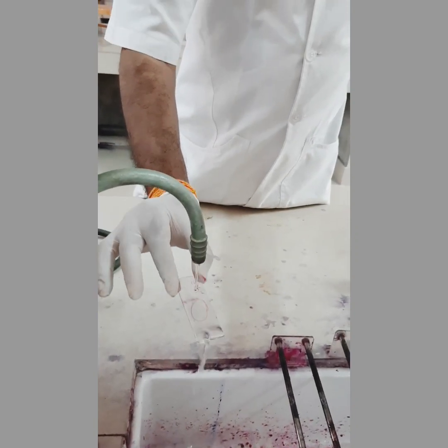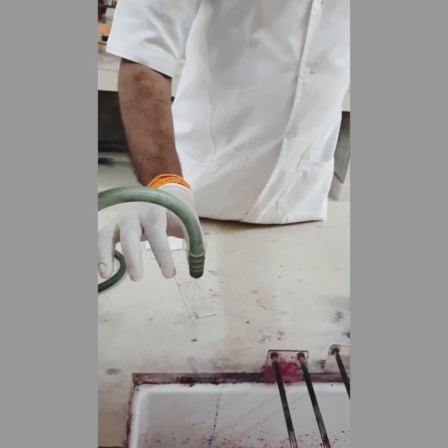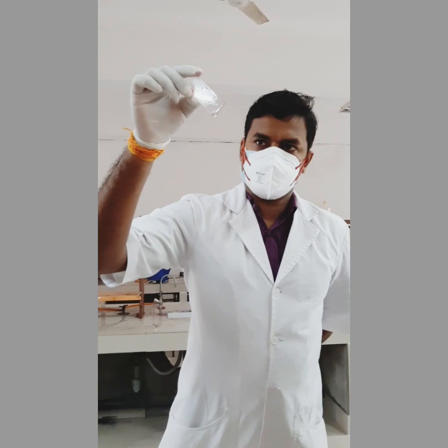After decolorization for 3 minutes, wash with water and check whether any pink color is retained in the smear.